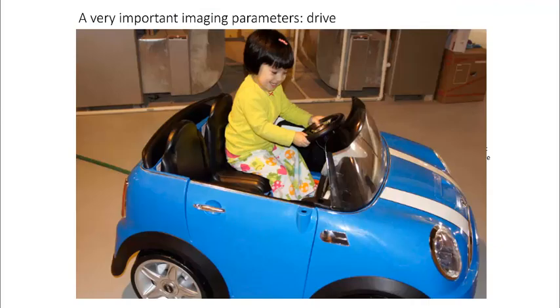And in order to protect the tip, the most important parameter here is actually drive. If you read a lot of AFM manuals or books, you will notice that not many of them discuss how important it is to define the correct drive. In my opinion, the parameter drive is super important. That's because this is how you define how sharp the tip is going to be after you first scan. If the tip is not sharp anymore, no matter how good your parameters are, your image is going to be blunt. It will be smooth and there's no resolution, no details.